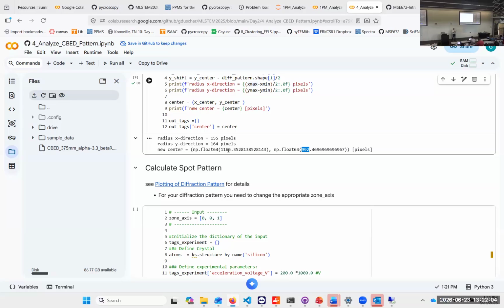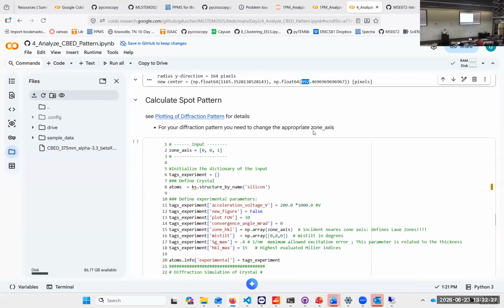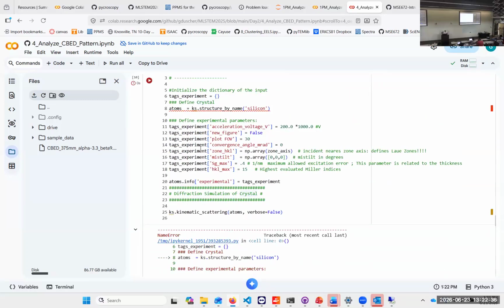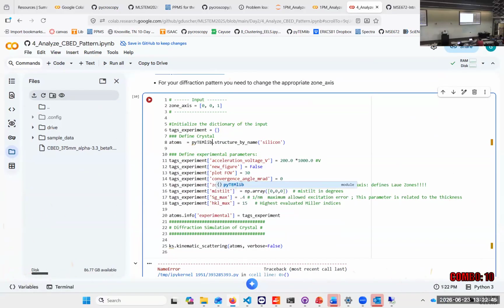If you're on the microscope and you find your center on your camera, it is actually quite advantageous to do that when you're on the microscope, because then everything is nicely centered, especially if you have a whole bunch of them, as you will see in the 4D STEM run. They always try to center that very accurately to not be bogged down with having to find the center. So the next thing is, okay, here we have the same problem I had before, and I will update that in a moment, because I can do that from here.